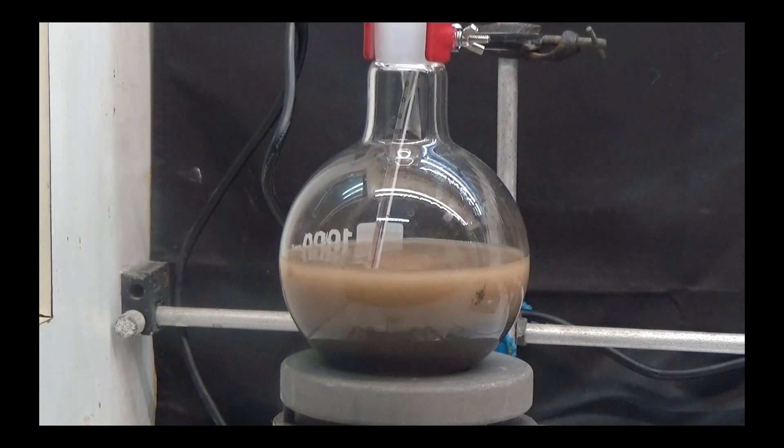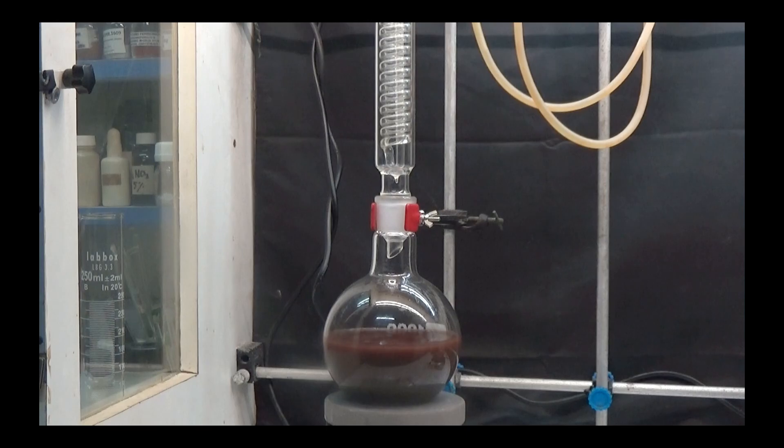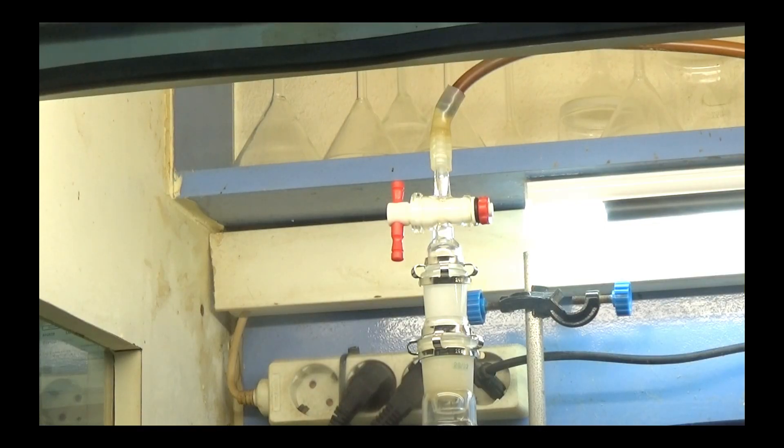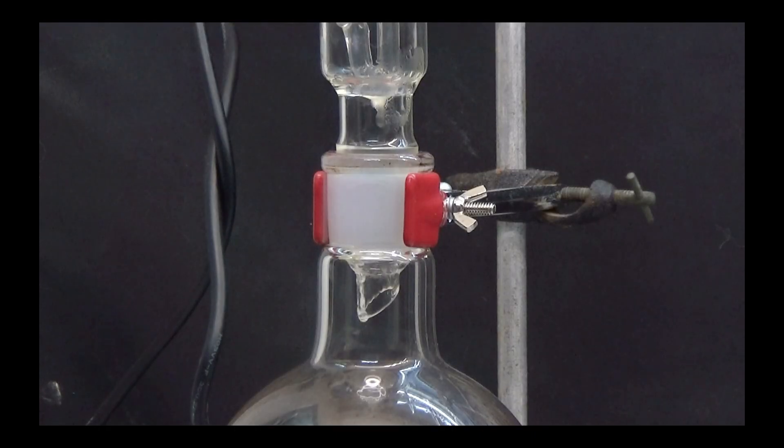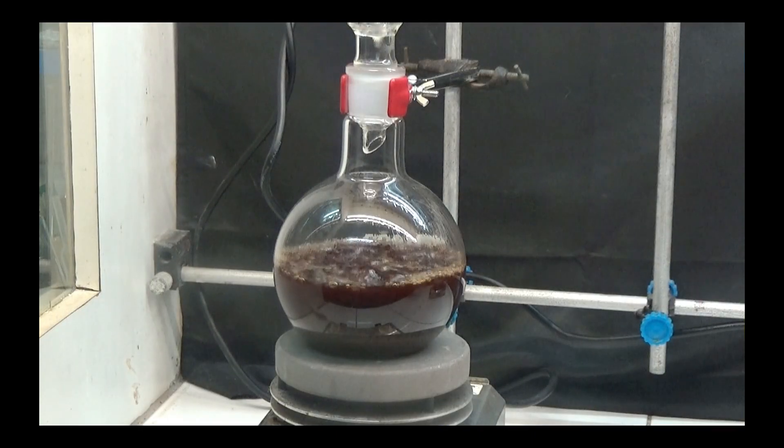We observe that upon completion of the addition of iron, the color of the reaction is brown. Heat at reflux for a duration of seven hours. Make sure the fume hood is connected to the condenser outlet. After seven hours of reflux, the color of the mixture has a red hue.